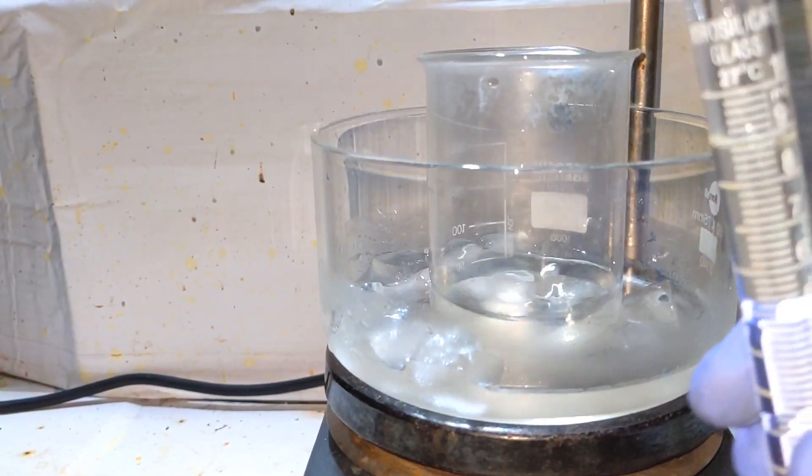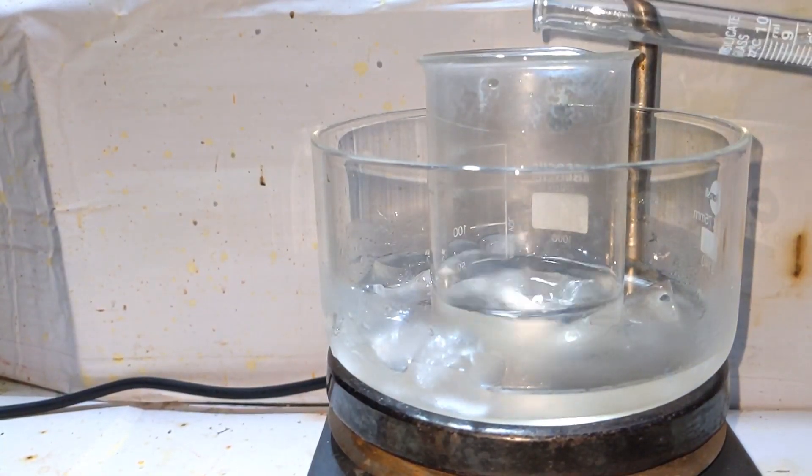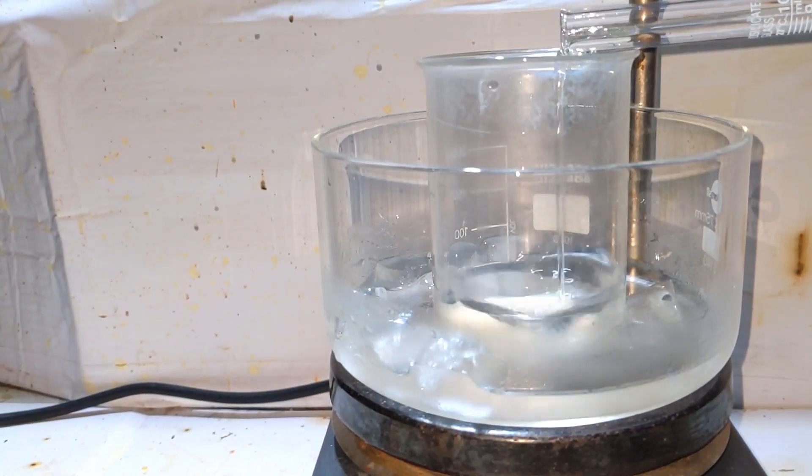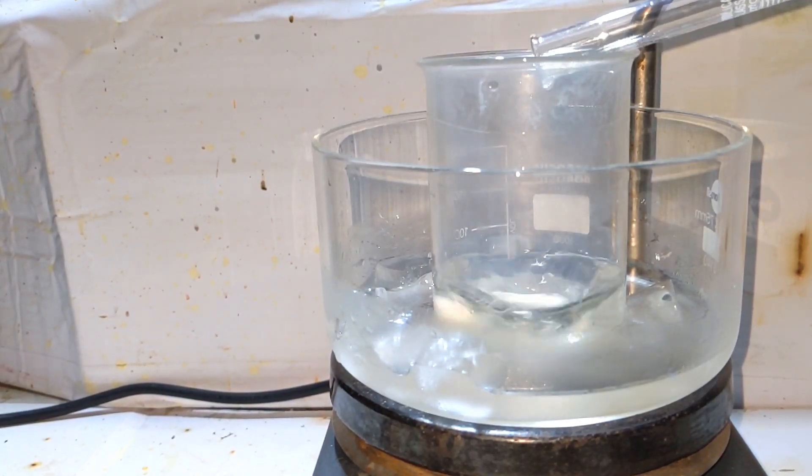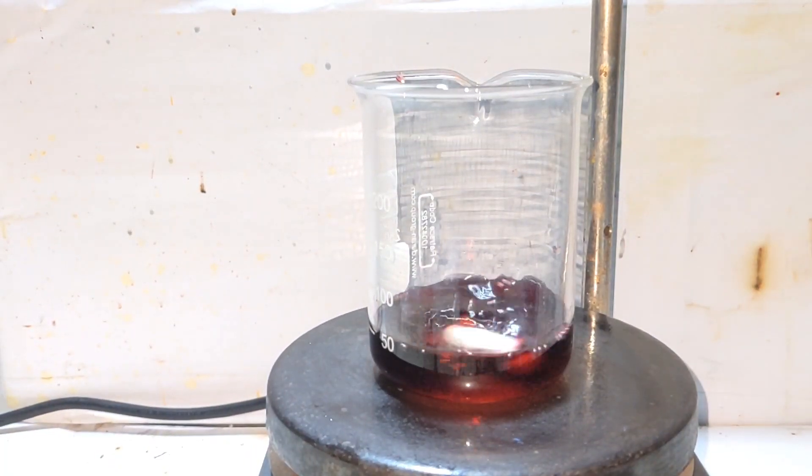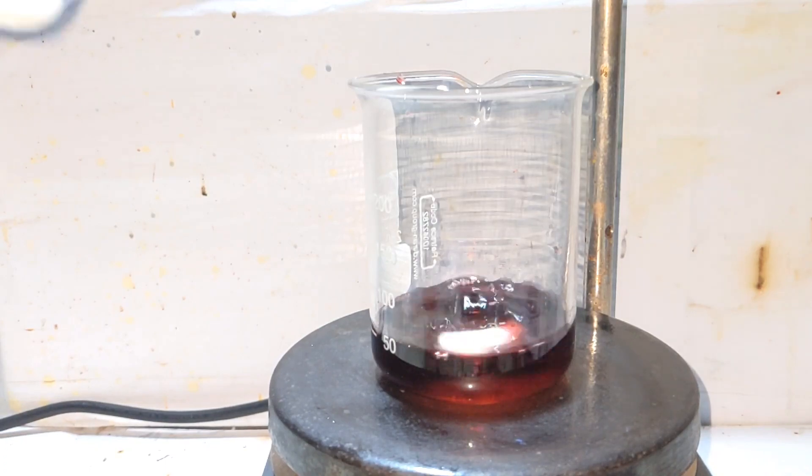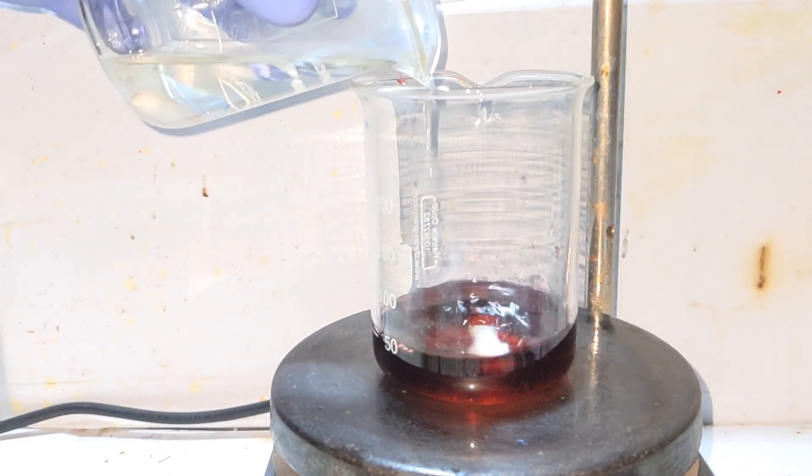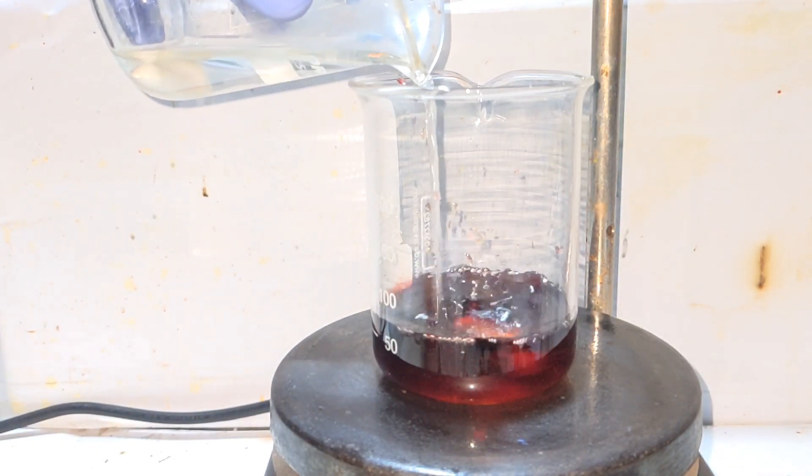Now add the 8.5 milliliters of 6 molar hydrochloric acid. Take the cobalt(II) chloride solution and into it was added the previously made ethylenediamine solution with the hydrochloric acid in it.